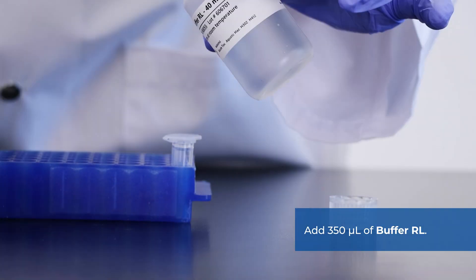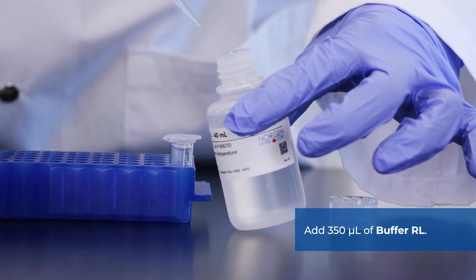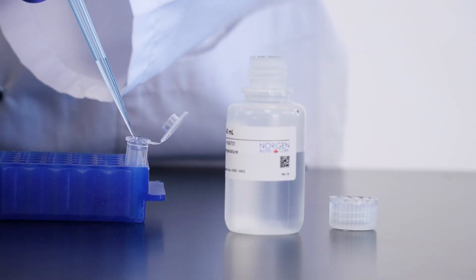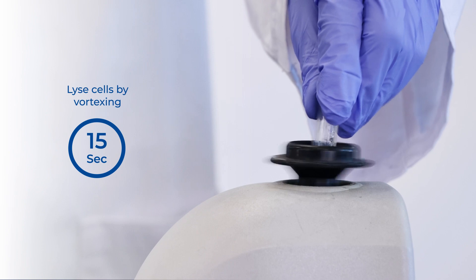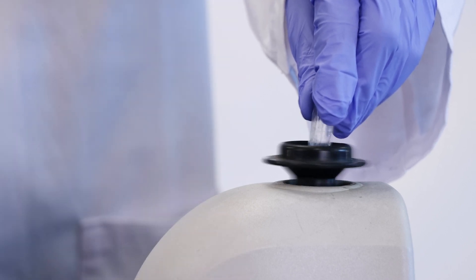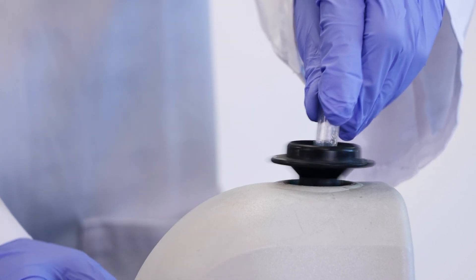Add 350 microliters of buffer RL. Lyse viral cells by vortexing for 15 seconds. Ensure that mixture becomes transparent before proceeding to the next step.